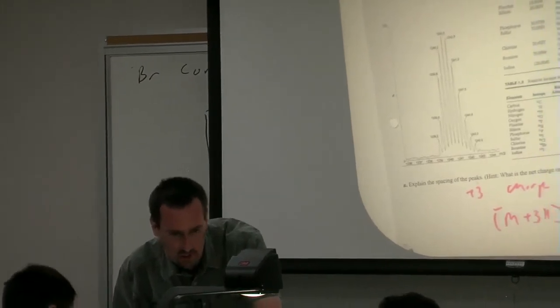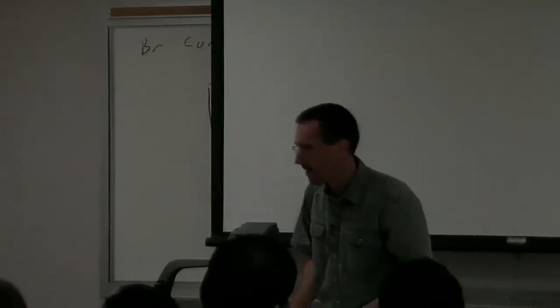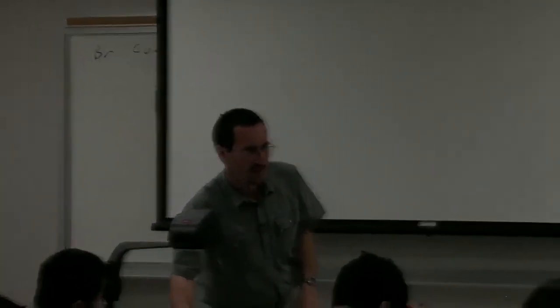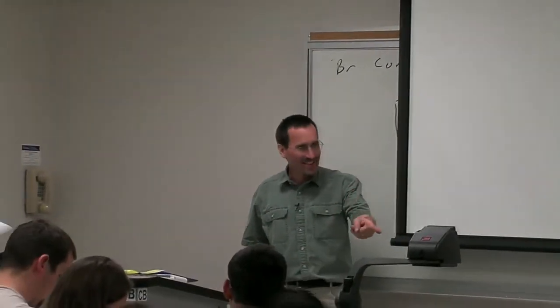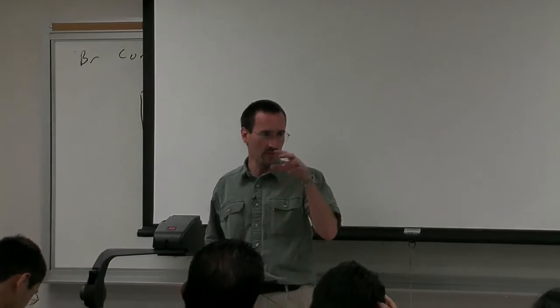It's all conceptual. It's all something that just involves really exploring this idea of what exact masses and isotopic abundances are. It's more like an NMR multiplet, as James says. And for those of you who go on, there are absolutely fascinating patterns from ruthenium compounds and osmium compounds and compounds with multiple rutheniums or multiple osmiums.